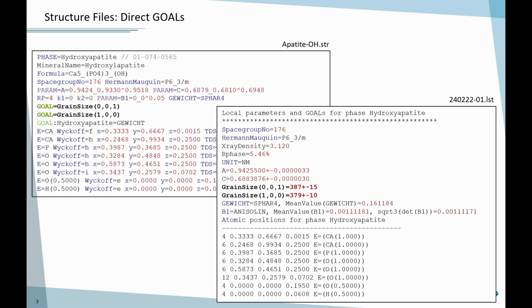So even though it was needle-shaped after the precipitation, we calcined it at 1000 degrees, and then the particles get more or less almost spherical. And you can see that is basically the same crystallite size in all directions. So that is no surprise. If the particle was still needle-shaped, I would expect very different sizes along the z-axis than perpendicular to the fibers.